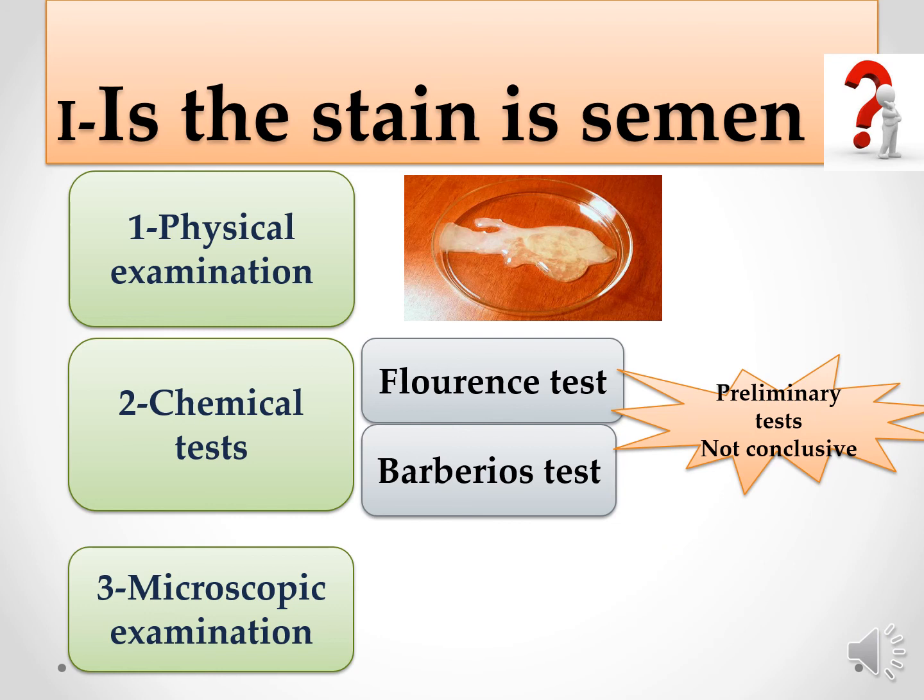Both are preliminary tests, not conclusive. So their value is that the stain may be semen.